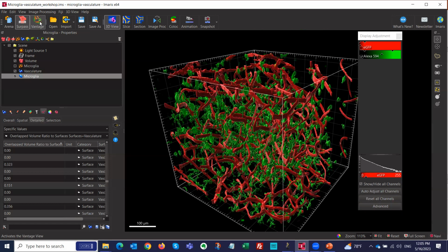It does use diffusion, which I'm going to show in the graphs, to create randomly generated statistics that you can compare with what you're actually having. There it's using an underlying diffusion law, but it does not directly do those kinds of things in Imaris. So there's also no fluid flow properties and those kinds of things we cannot calculate in Imaris. That's more for a CFD program.